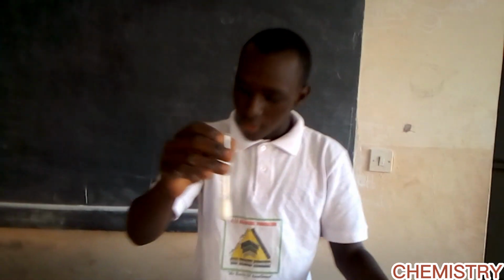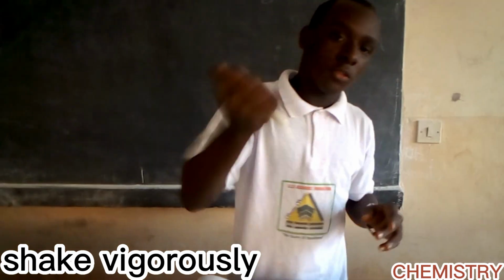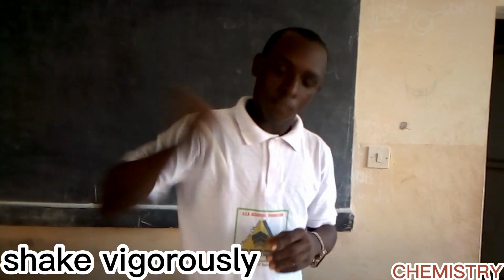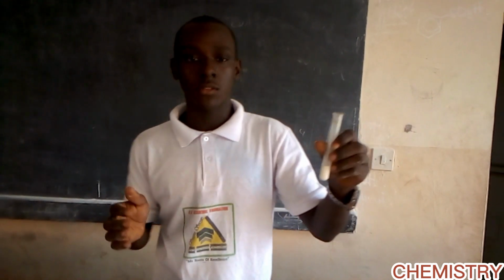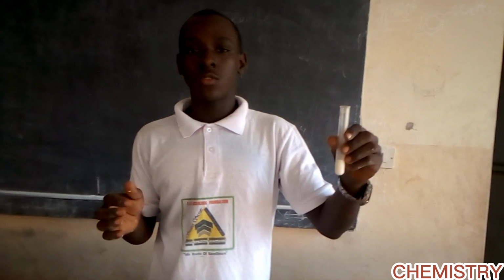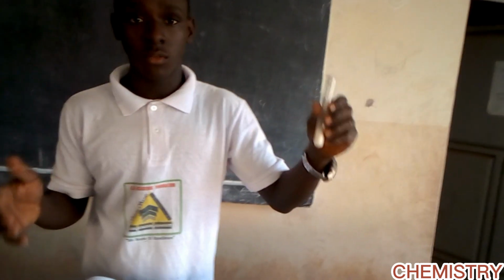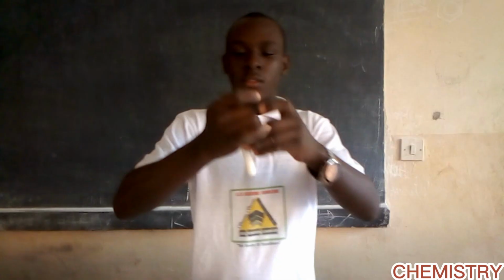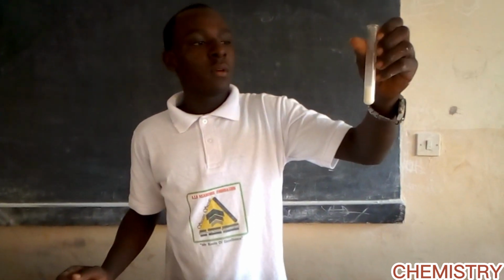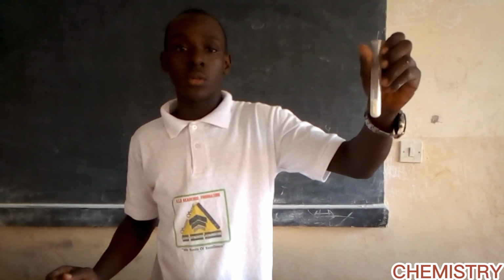After adding, they have said shake strongly to dissolve. So we are going to shake strongly so that you get clear results. If you don't shake strongly, your results will not be clear. Why? Because the solid may not have dissolved the way they want it to, hence giving you wrong results. So if they tell you shake strongly, you must shake strongly. Then, after shaking, we have obtained a white solution.